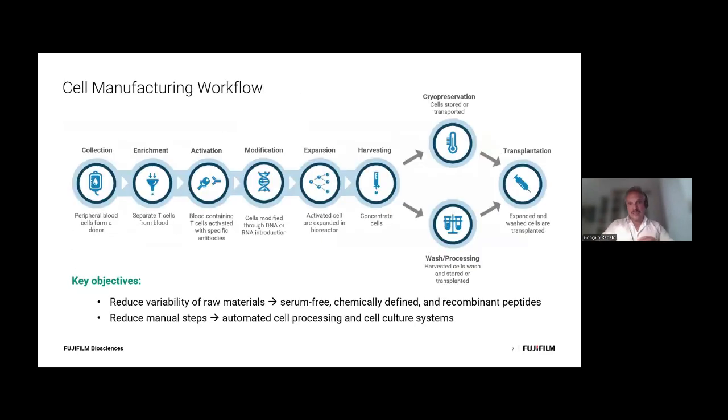And when we look at that in terms of process architecture, this is a very general cell therapy process, starting with a collection step, an enrichment step. If it's a T cell, these T cells might be activated, genetically modified. If it's a CAR T or a TCR-T type of process, expanded to a clinical dose, harvested, formulated, often cryopreserved, and then all the way to the bedside.